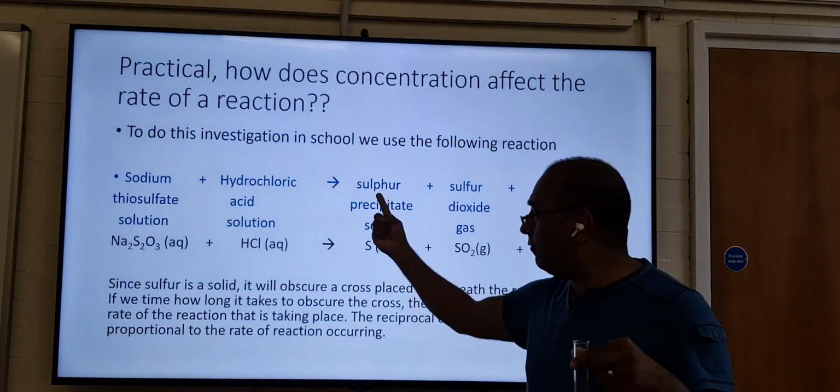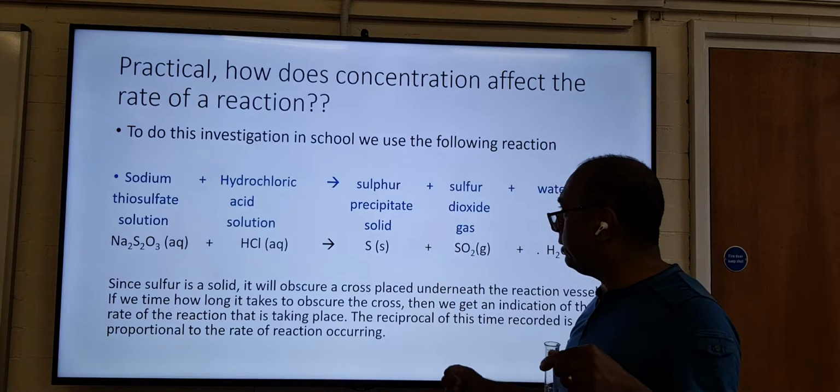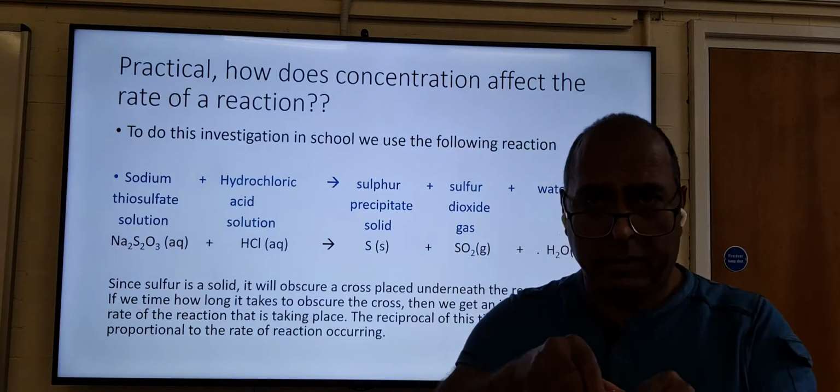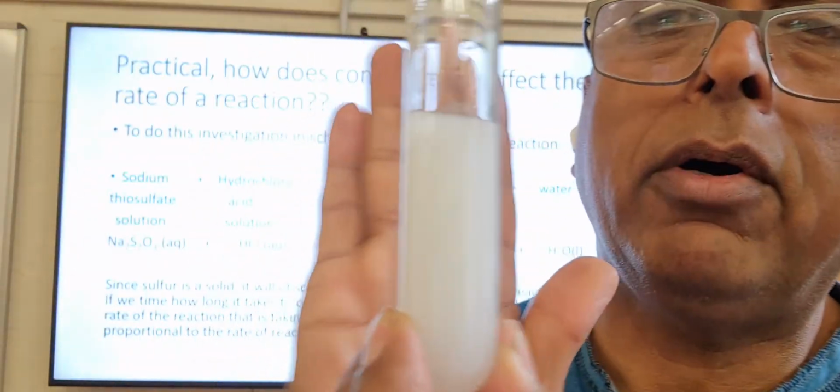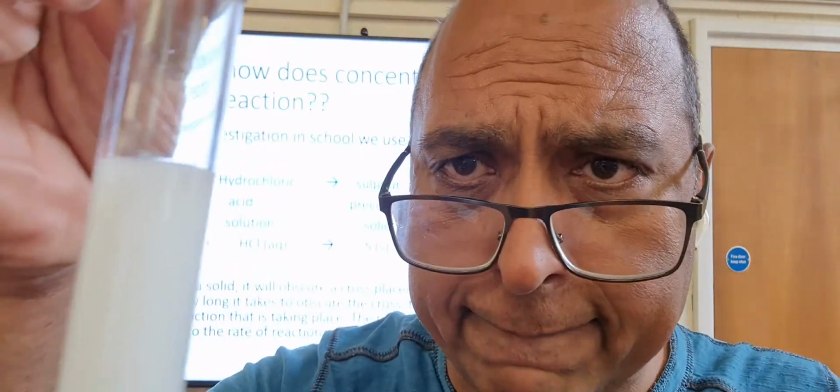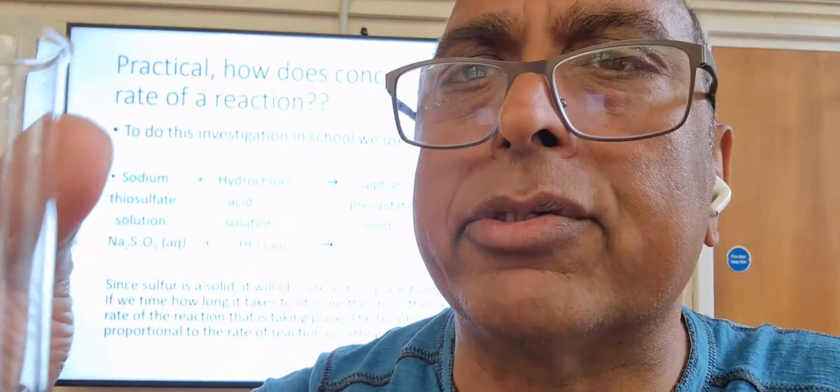We get that sulfur precipitate solid, and it makes that cloudiness, which will obscure anything behind it. That's the idea we use.